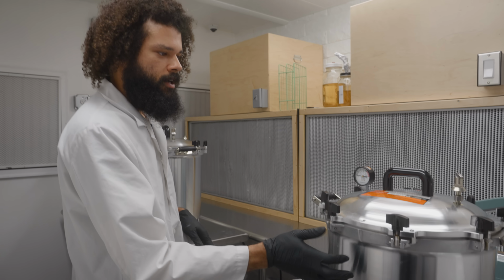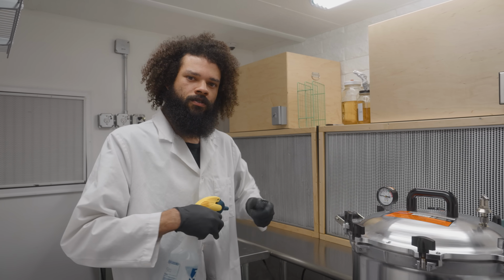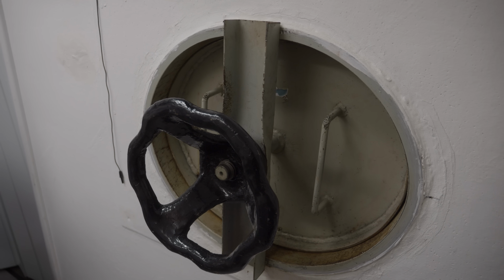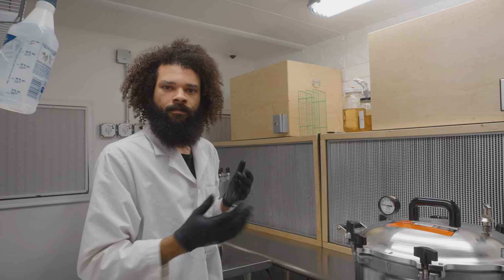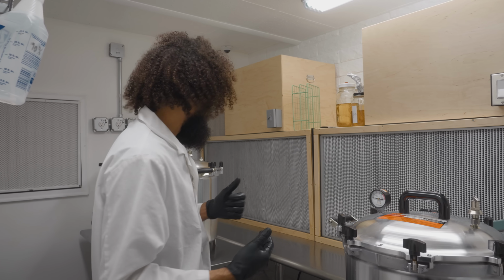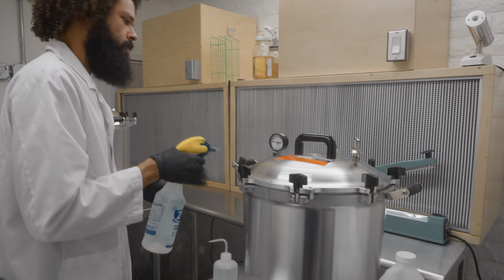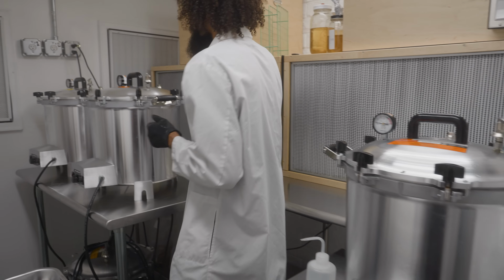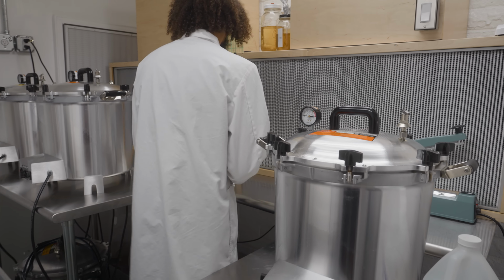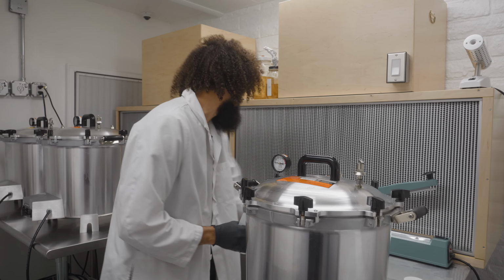So these sterilizers come in handy for making the Generation 1 spawn bags. Then we can use the autoclave that's built in to make the Generation 2. We do about 80 bags a run and use 8 spawn bags to inoculate those 80 bags. And there we go. So actually just give ourselves a good misting of the sterilizers. Now just do a quick wipe down of the inoculation area, or surface area in front of the flow hood.